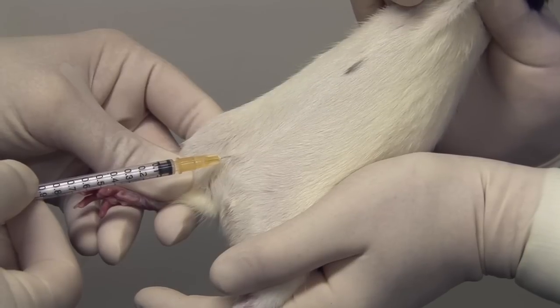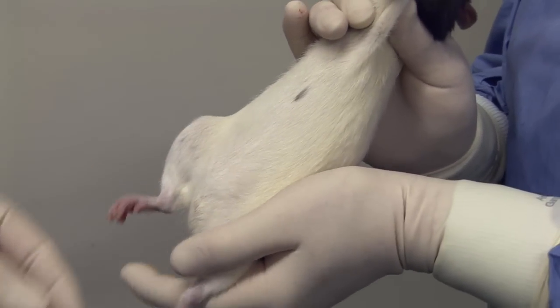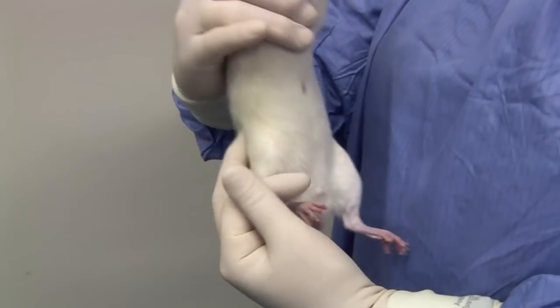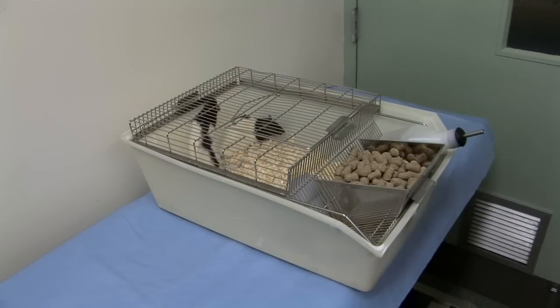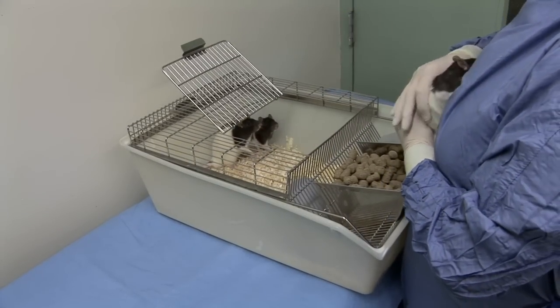The injection is carried out and the needle withdrawn. The rat is then placed into its cage and released. Prior to release, it may be identified, for example with a tail mark, to confirm that the injection has been administered.